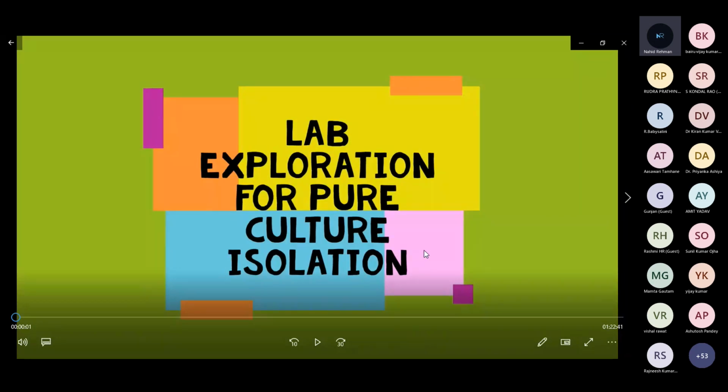So to start with, you must be equipped with some microbiological techniques. Either you can buy the pure microbe from culture collection centers, or you can isolate these microbes from the industrial zone or the effluents which you want to degrade. If suppose you are isolating from an oil spill region, then definitely the microbes growing in this oil-rich effluent would be the microbes which will very happily degrade the different fats or oils.